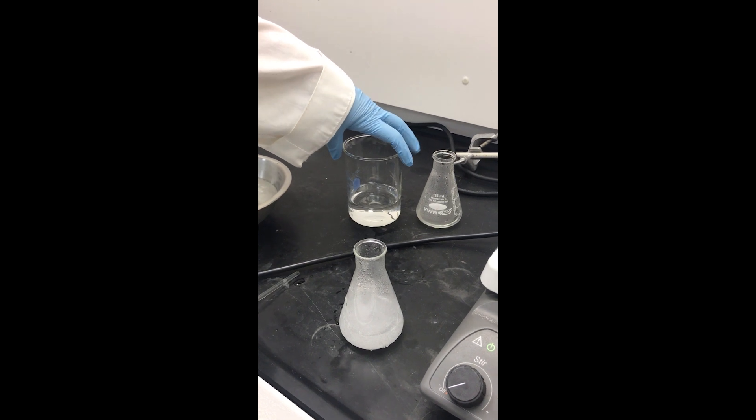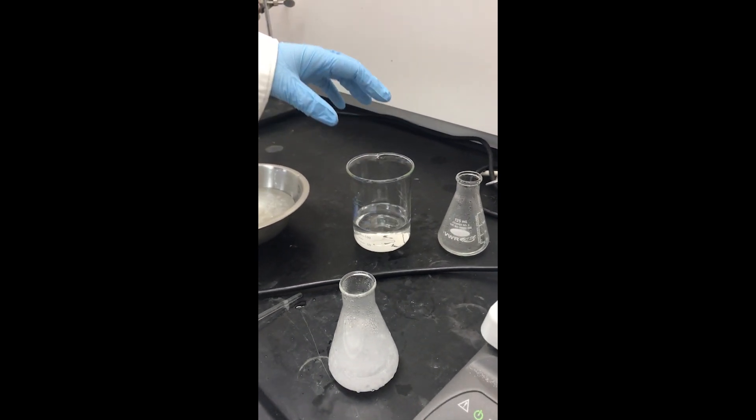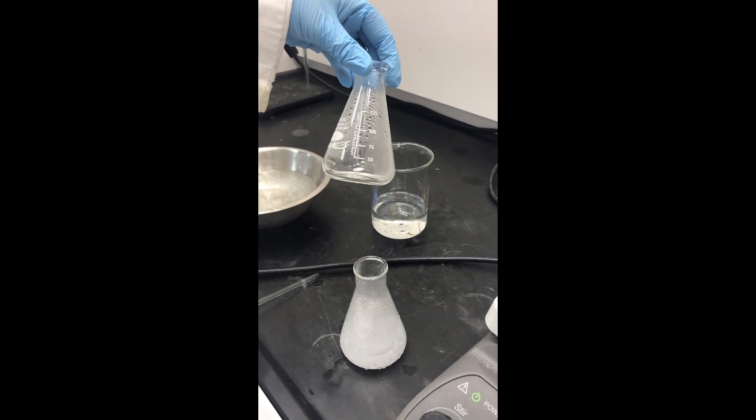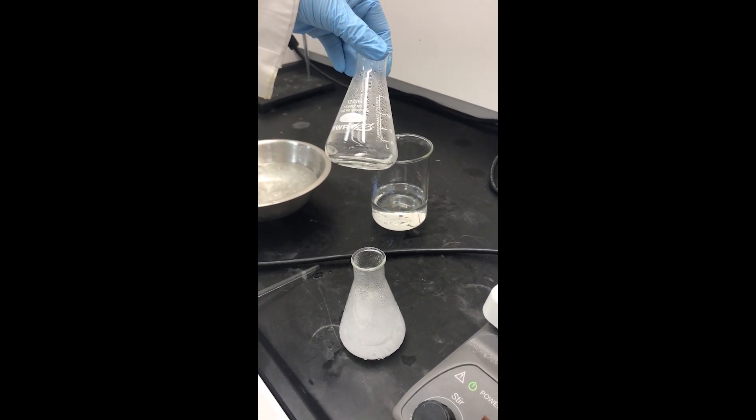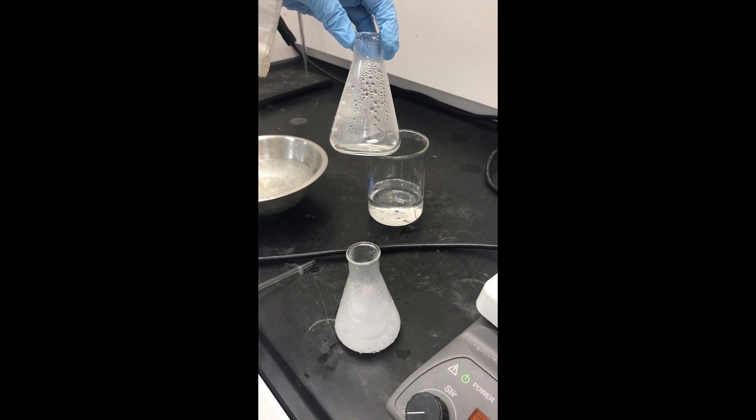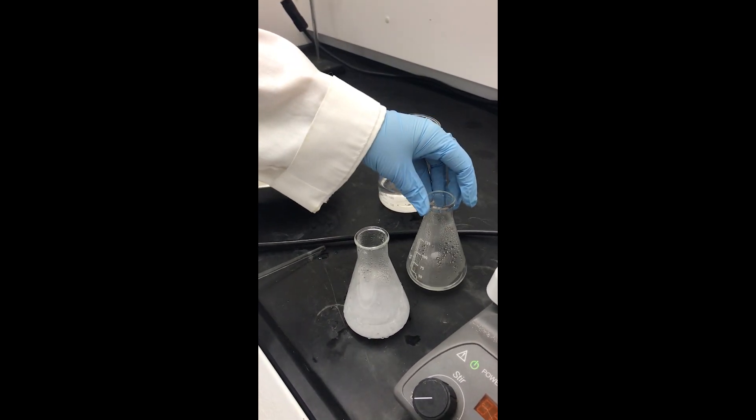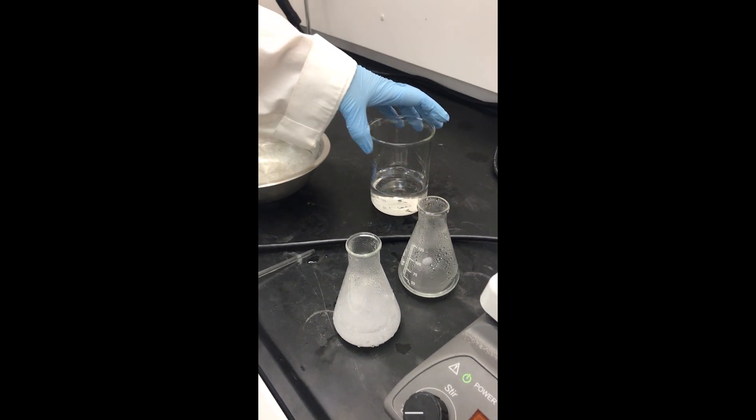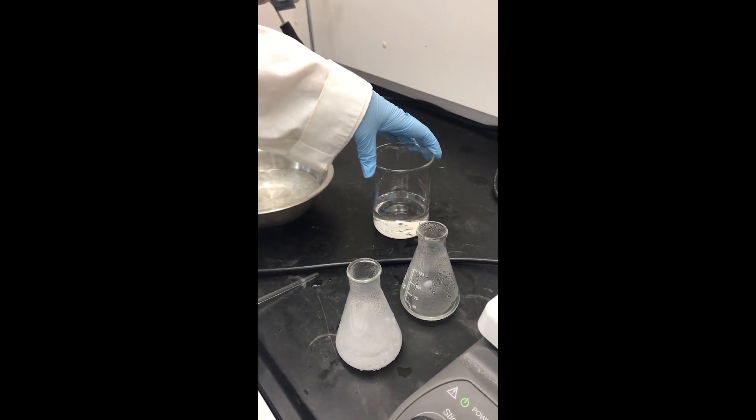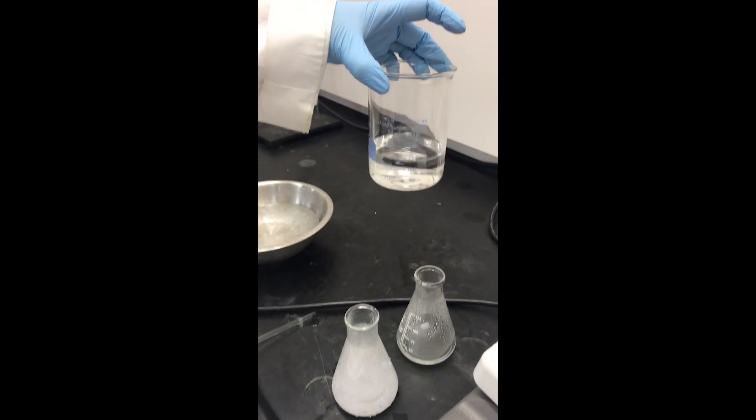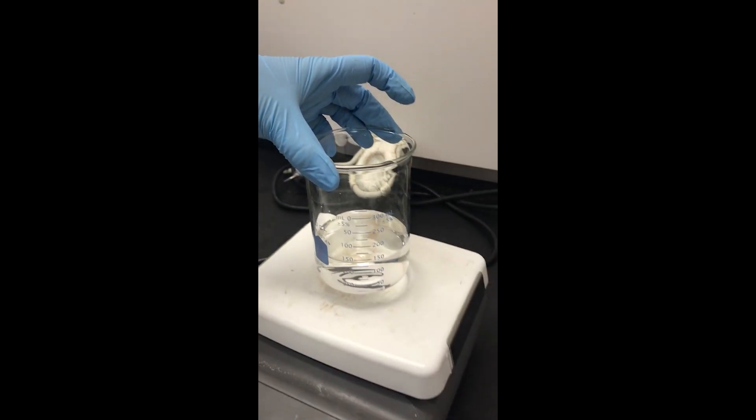One thing I wanted to mention was in the demo, I used water as the solvent. But you're not always so lucky as to be able to use something like water, which is very safe, as your recrystallization solvent. So if you had to use a different solvent, especially a flammable solvent or something that has a very low boiling point relative to water, the best thing to do is indirect heating.